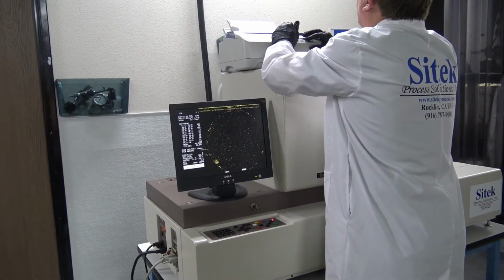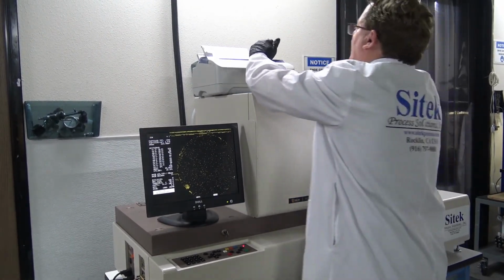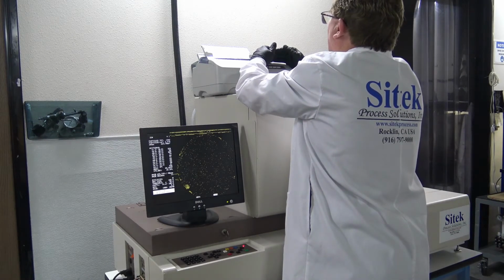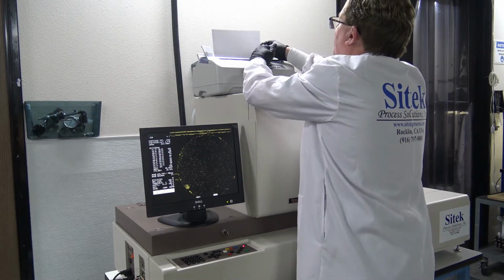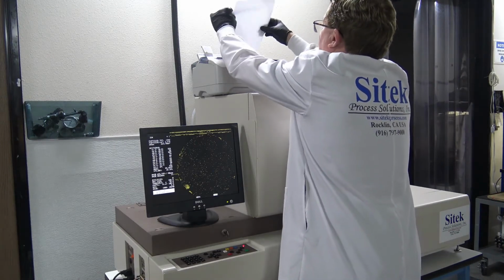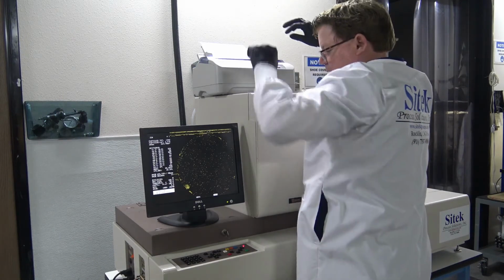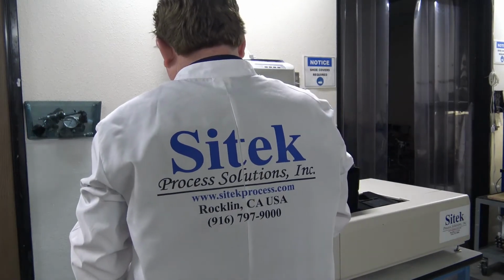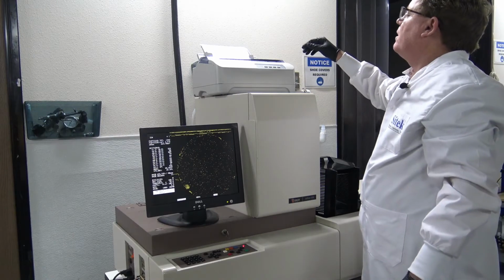Let me take it offline, back online, turn it off. Okay, let's load back out. This uses continuous paper. If you have single paper, it only accepts one sheet at a time. There you go, load. All right. Printer disconnect. There we go. As you saw, I had to turn the printer back off, and it's going to print now.